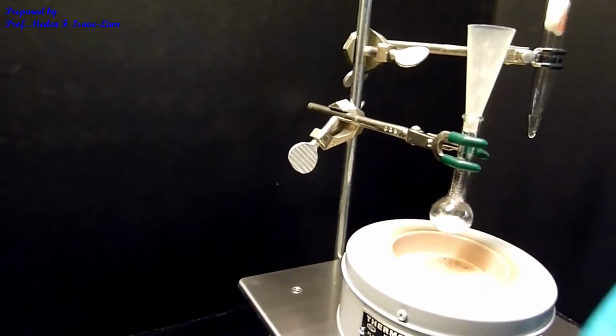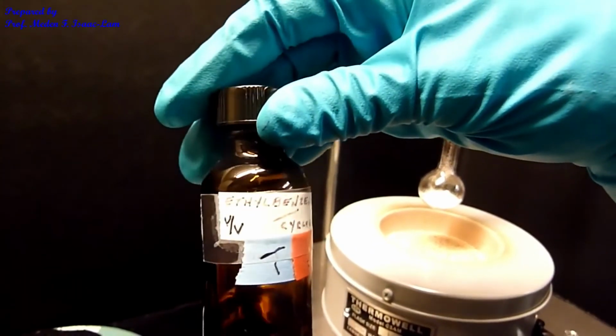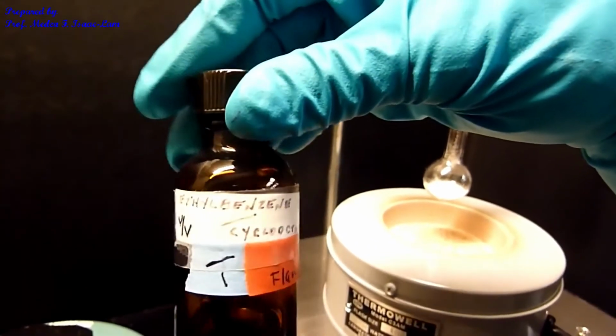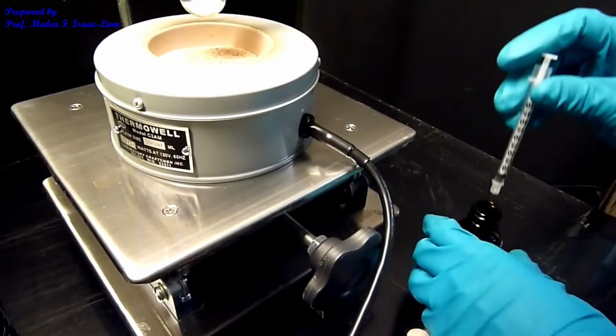And then I'm now going to add the ethylbenzene cyclooctane mixture. It's 80% ethylbenzene, 20% cyclooctane. And I need 0.4 ml.